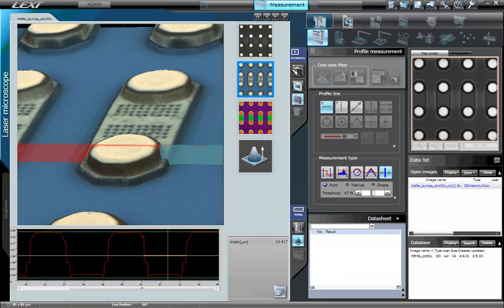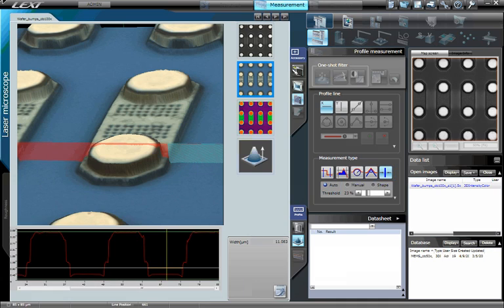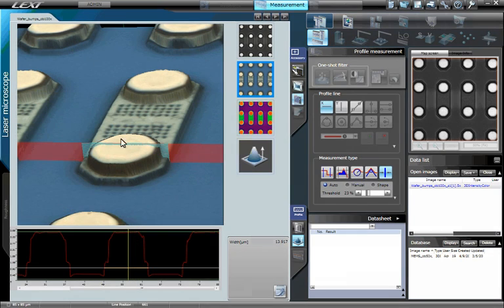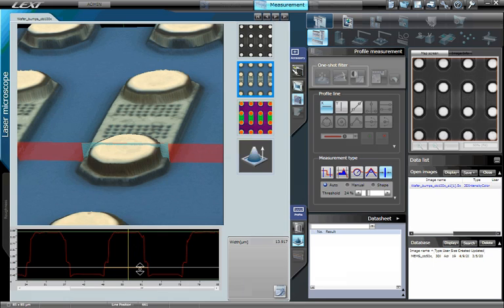Further, the LEXT can automatically measure line width. For example, let's automatically measure the width of this wafer bump. From the menu Measurement Type, select Line Width and Auto below. On the graph, position the yellow vertical line on the feature in which you wish to measure the width.